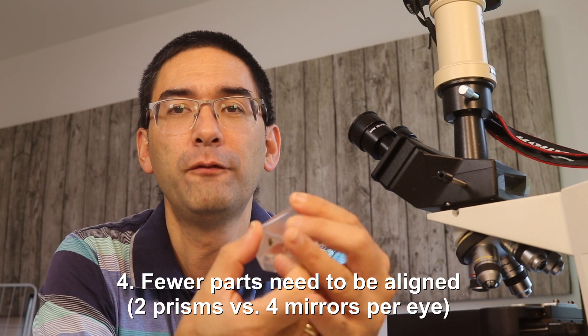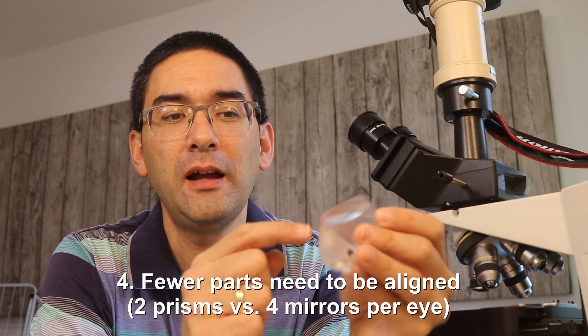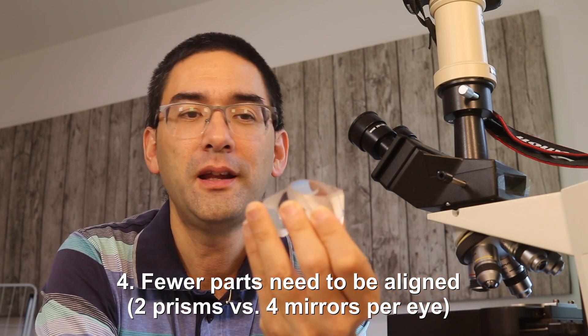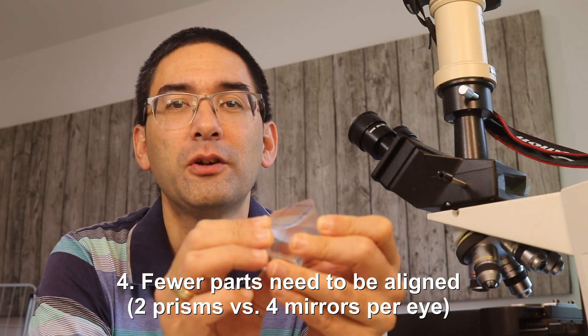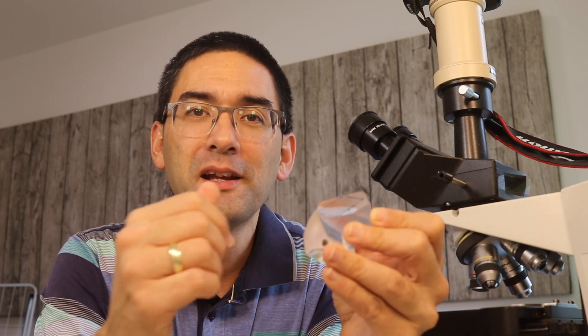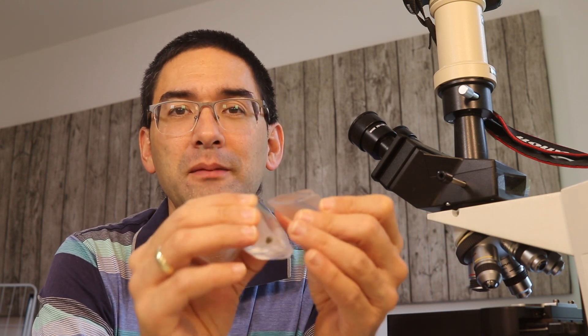This is also yet another reason and that is the alignment of the mirrors because when you have those prisms here and they're aligned like this, you need actually four small mirrors and they all have to be properly aligned. And this is already something that has to be done very carefully and if you bump against the microscope and the mirrors kind of slip out of alignment, then you don't get a good picture anymore because you see double.